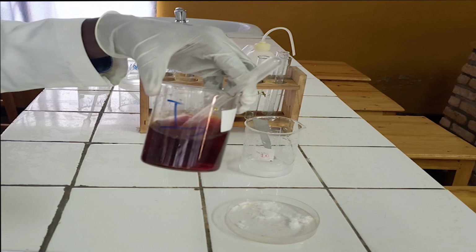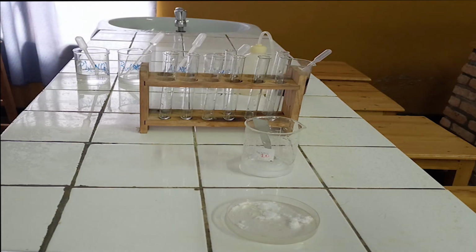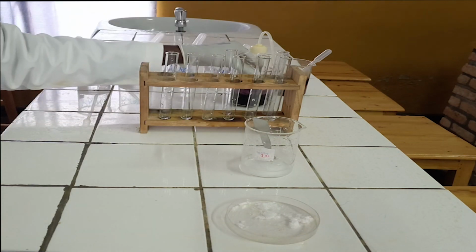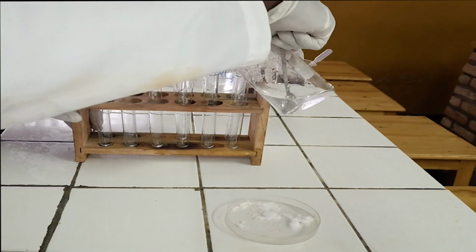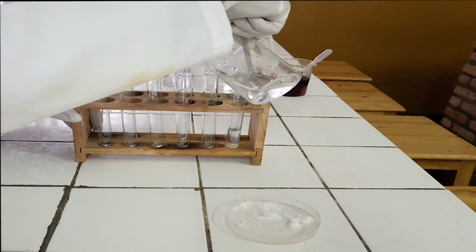6. Iodine solution. 7. Acidified potassium permanganate solution. Second step, divide the solution into test tubes, pour around 5 ml in each test tube.